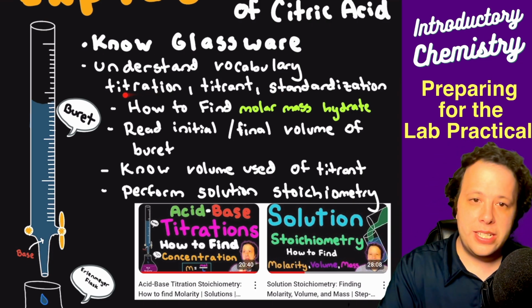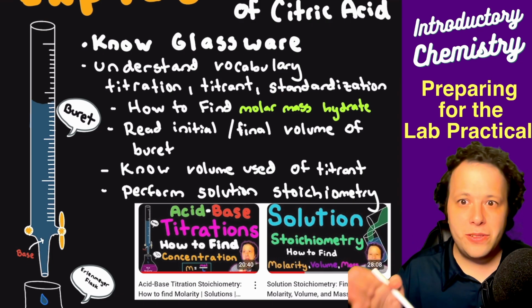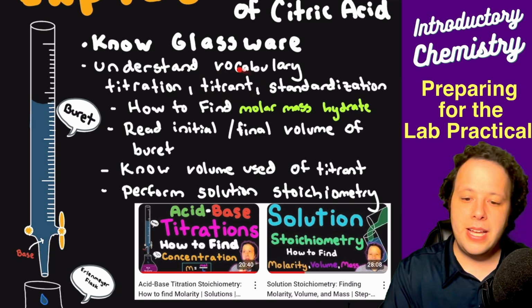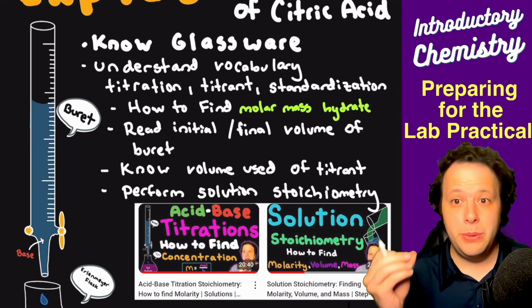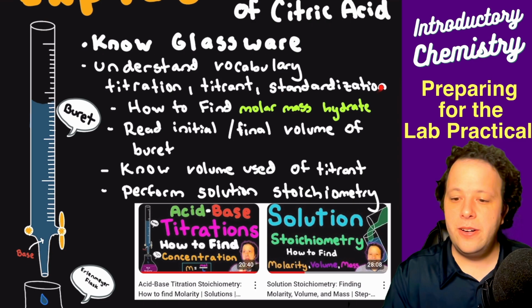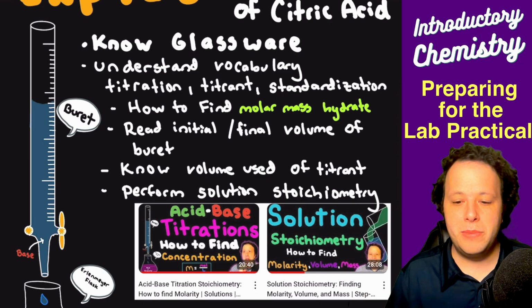So the first thing is there's the word titration, meaning that you're taking an acid and base, you're canceling them out. There can be other chemicals, but in our case, it's an acid and base. There's one word that in lab I mentioned to some students, but not everybody, and it's the word titrant. This is the chemical that you know the volume and the molarity of. So for us, that was sodium hydroxide. Standardization was what we did to find that molarity. So that's another concept, being familiar with those terms.